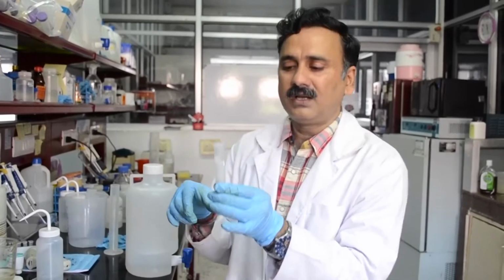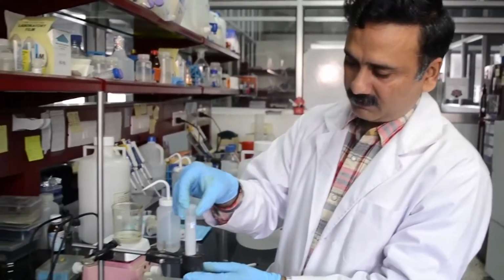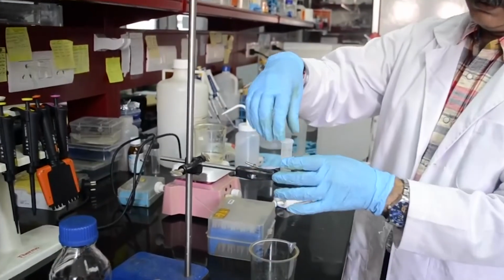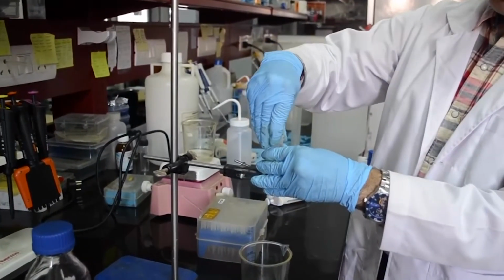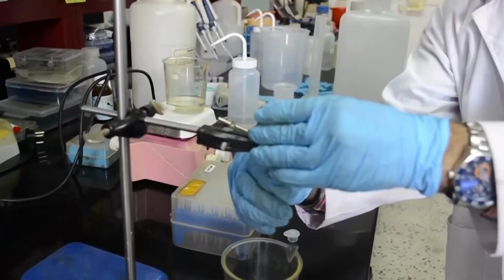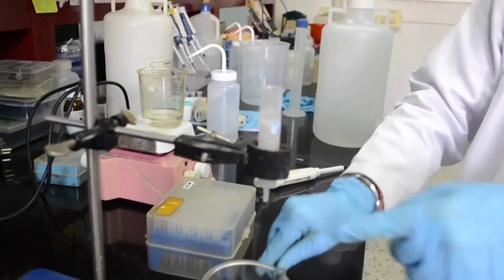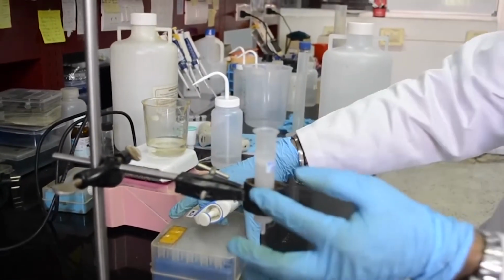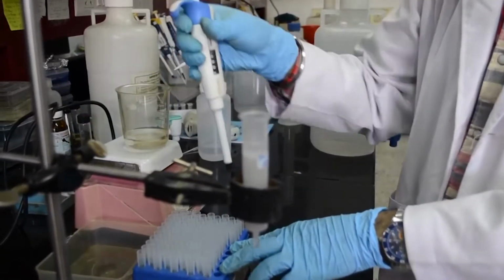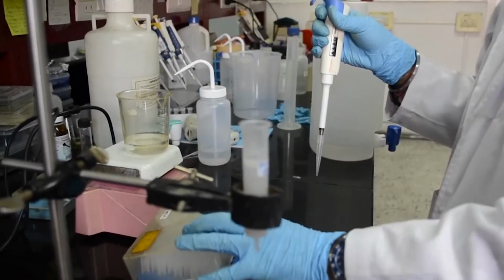So, let us start the NAP10 column mediated desalting. First, you fix your column into the stand, then you remove the cap from the top, and then you remove the lower end and let the column run. You see this level should come down to the level of the disc, and then you can start pouring the buffer of your choice.